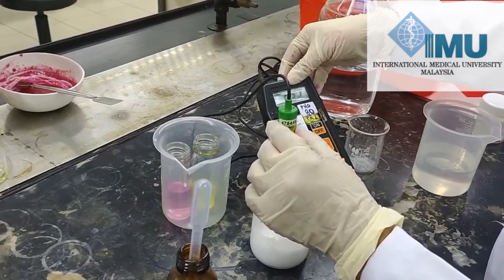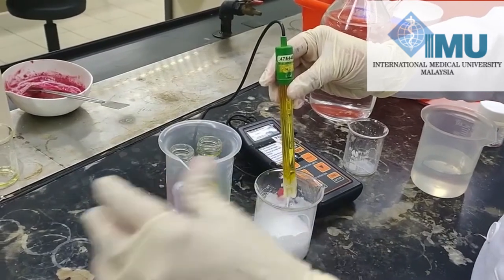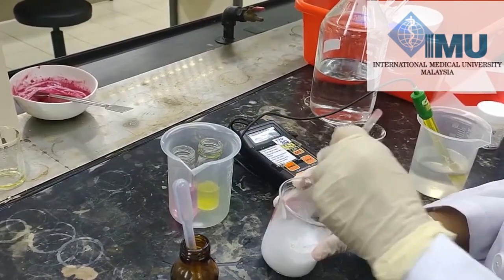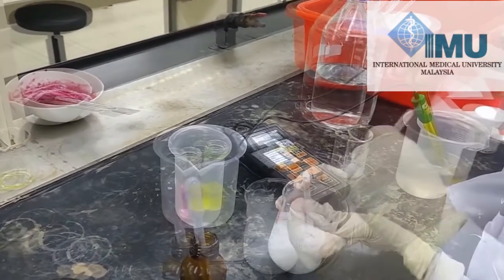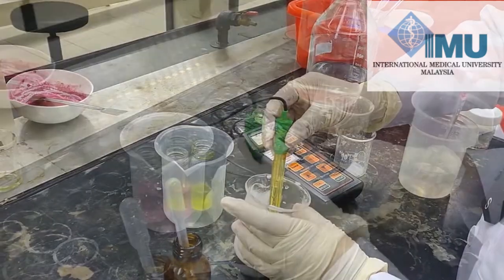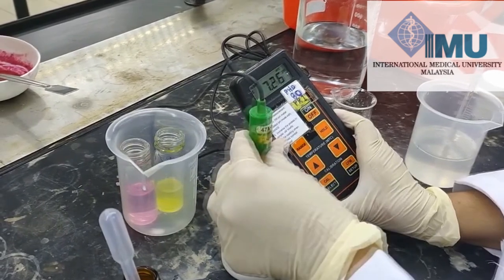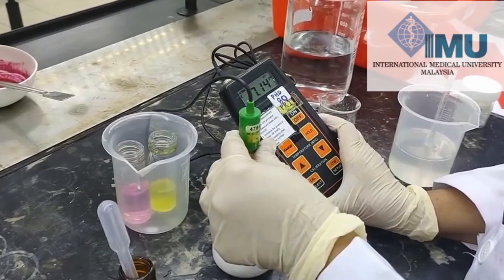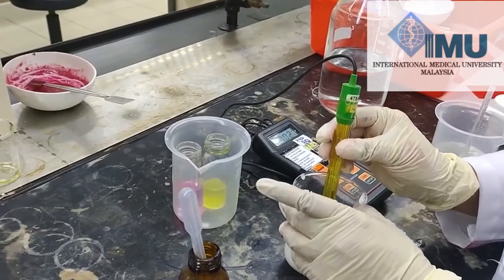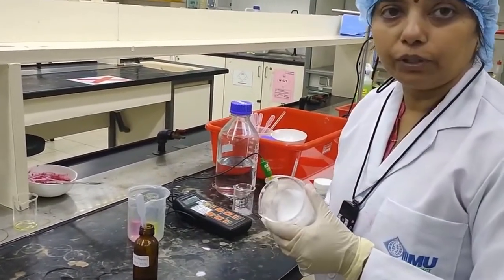We have to neutralize the shampoo to a neutral pH. We will add a few drops of orthophosphoric acid and mix it properly. You can see the pH is decreasing. Now our pH is around 7, which means our formulation is ready. We have adjusted our shampoo to neutral pH and it is now ready to use.